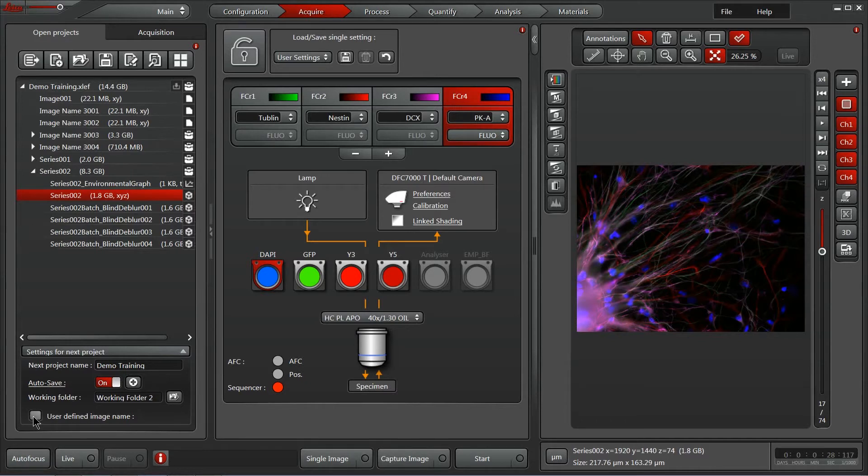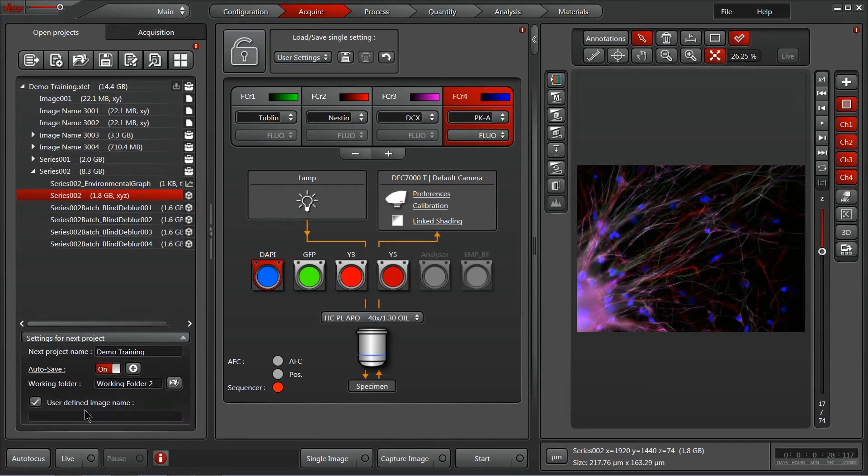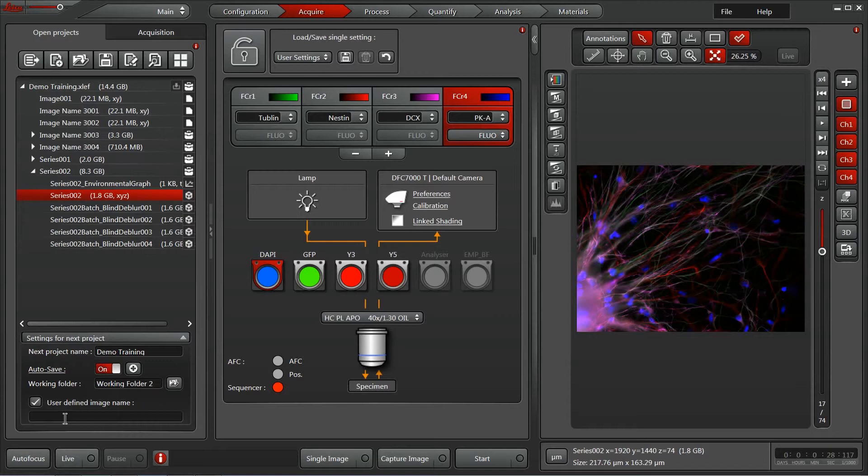On the bottom, you can also activate a user defined image name. So, rather than having the default image name 001, you can actually put a sample specific name to help you keep your data nice and organized.